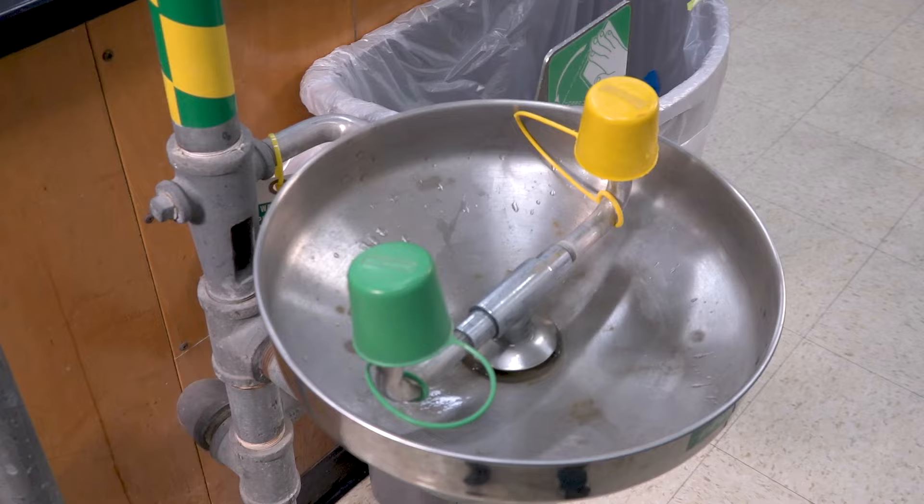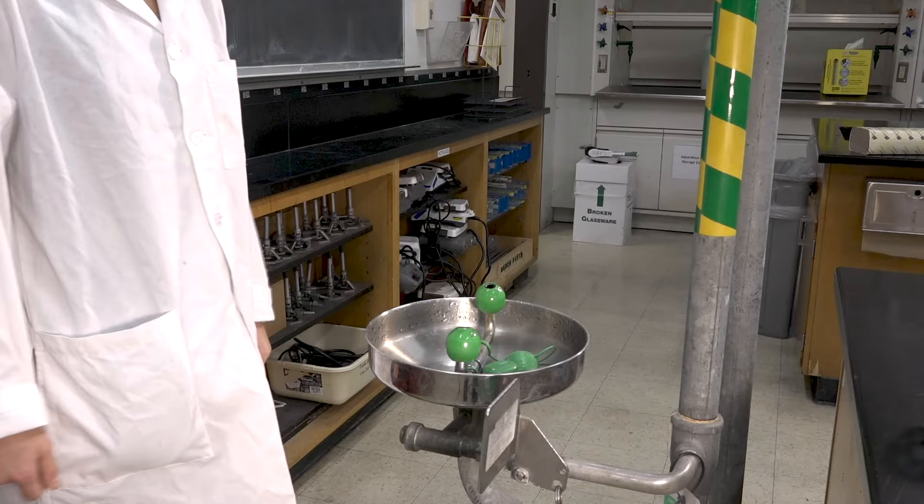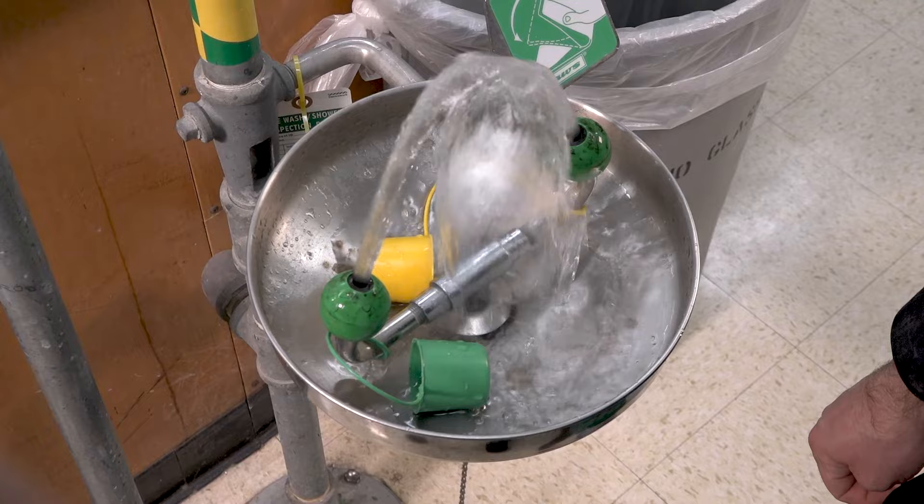For any chemical spill that splashes or otherwise gets into your eyes, the eyewash will be necessary. Press the pedal with your foot and hold your eyes open under direct wash for at least 15 minutes. This may be uncomfortable, but it's much better than damage to the eyes.